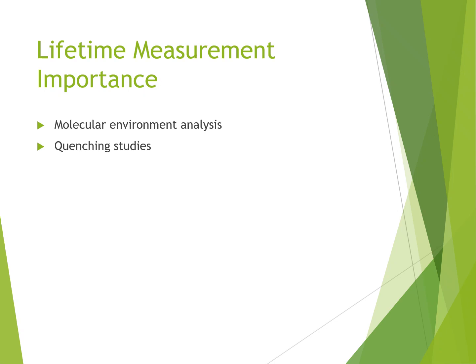Now, importance of lifetime measurement. Lifetime measurements help study molecular interactions, quenching and environmental effects. So they are widely used in biological research. Lifetime measurement is very useful to study the molecular interaction, the quenching effects and the environmental effects, and that is very important in biological research.